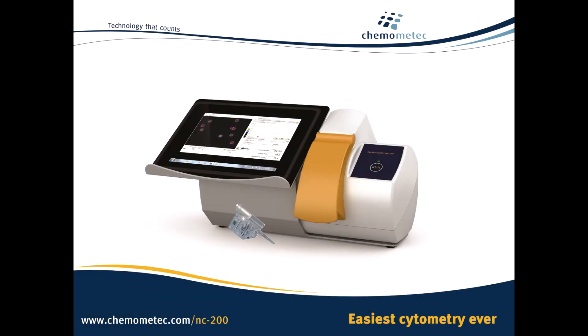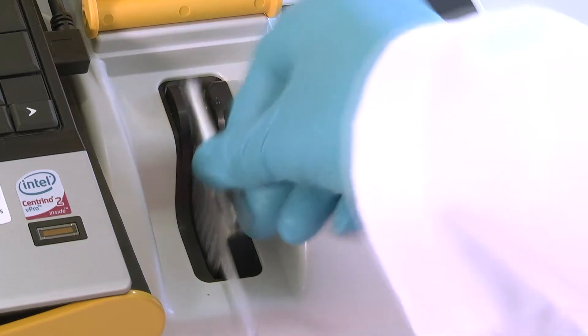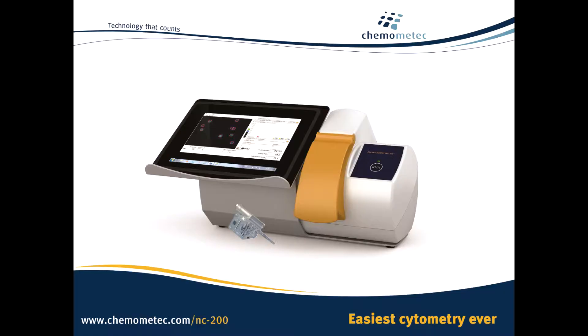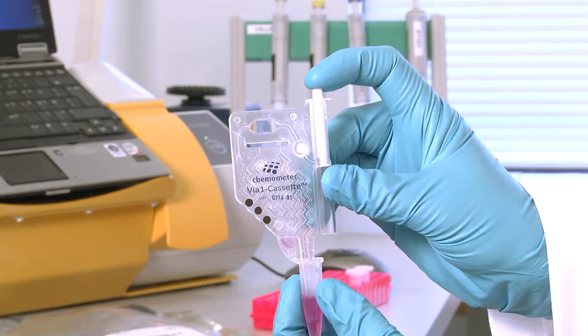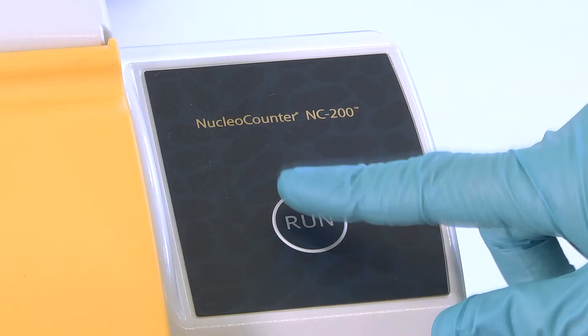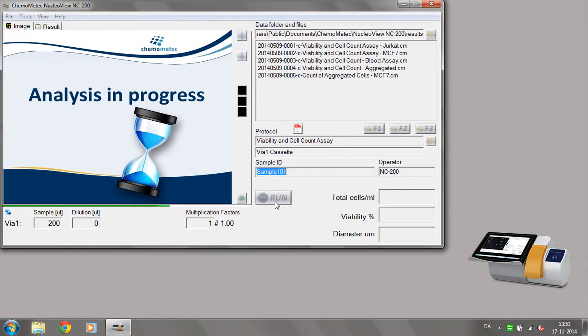The NucleoCounter NC200. High precision cell counting has never been easier. Simply load the cassette, insert and press run. In less than 30 seconds you have your results.